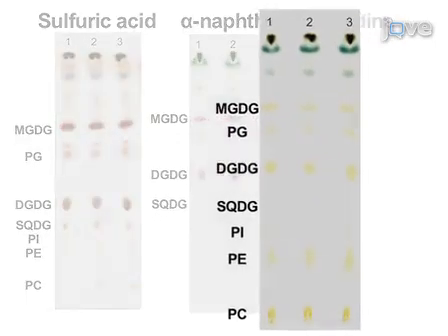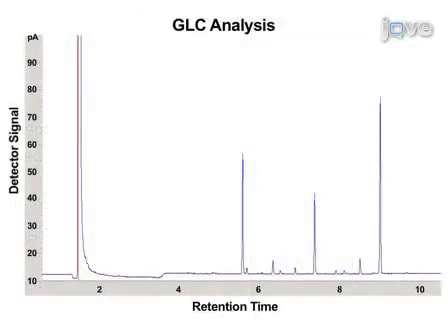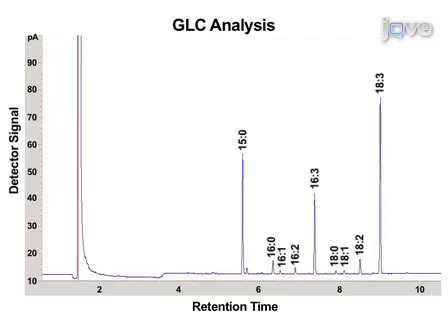The iodine staining is reversible and gives lipids a yellowish color that will disappear over a short time as the iodine evaporates. Briefly, iodine-stained lipids can be subjected to GLC analysis, although unstained lipids are preferable to reduce the breakdown of lipids. If done successfully, distinctive signals representing different fatty acyl methyl esters will be observed after GLC. Fatty acyl methyl esters with shorter carbon chains and fewer double bonds have shorter retention time using the DB23 column.